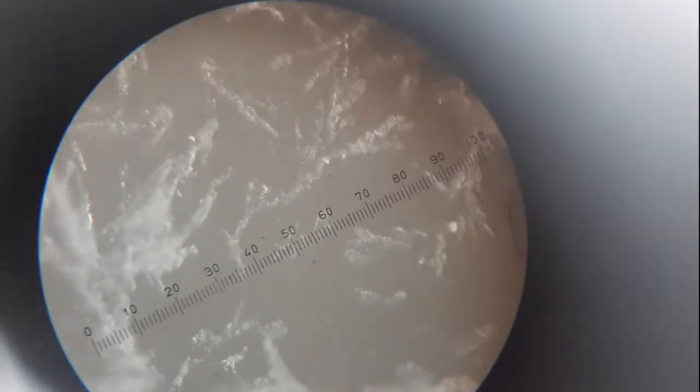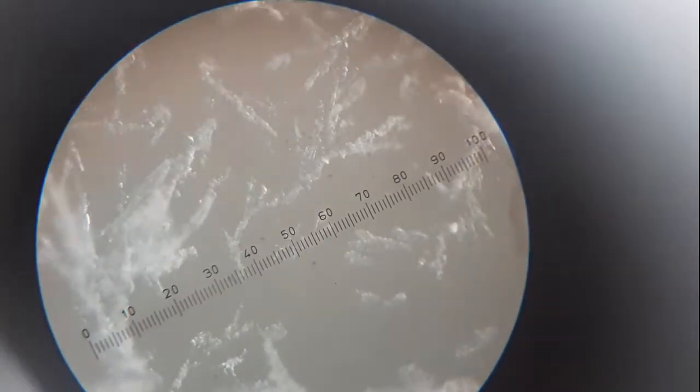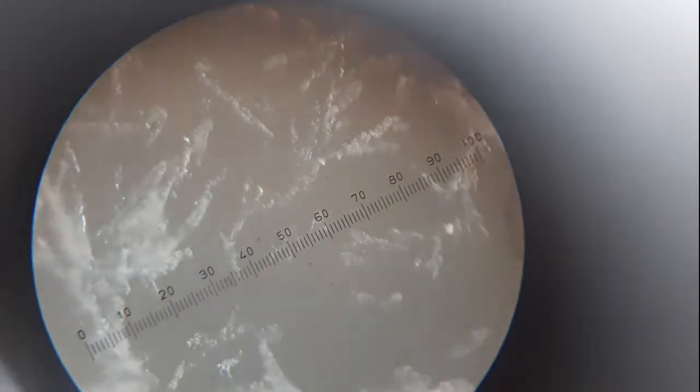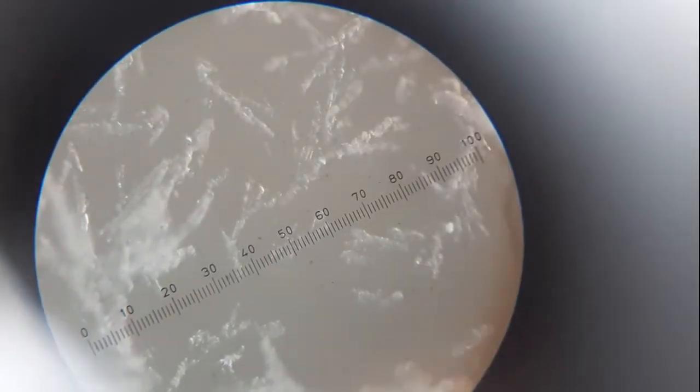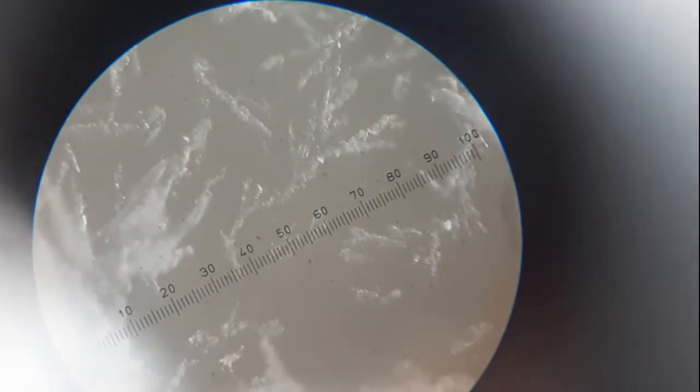Now you can see these are the crystals formed in the first 10 minutes. We have calculated the average size, and the average size of one crystal is 18 units of the eyepiece.